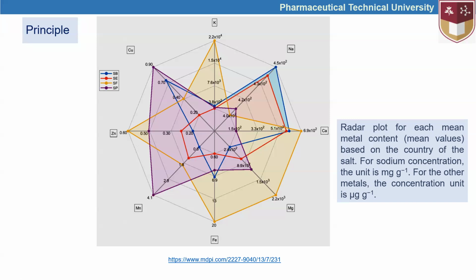The point I'd like to highlight is that these atoms could be identified and analyzed, and for that, the significance of inert gases deserves some attention. Since they are inert, they do not react with these atoms, so it will be possible to see the emission spectrum of those atoms.